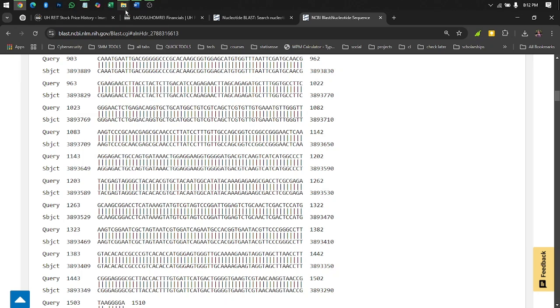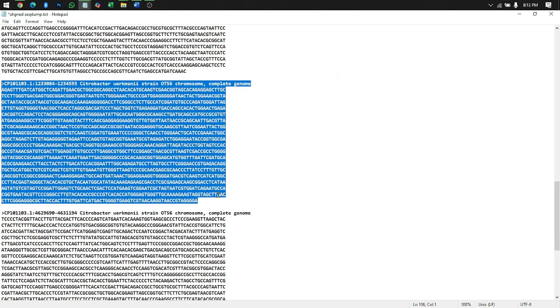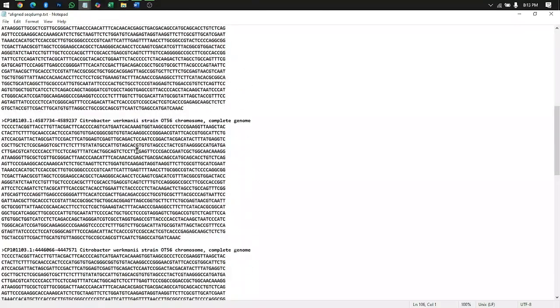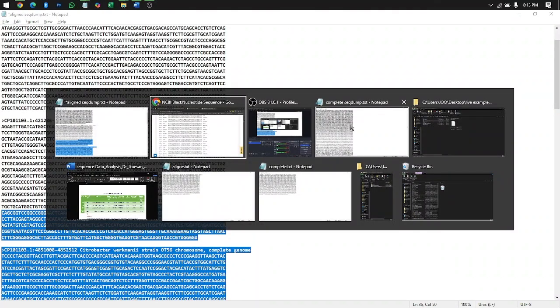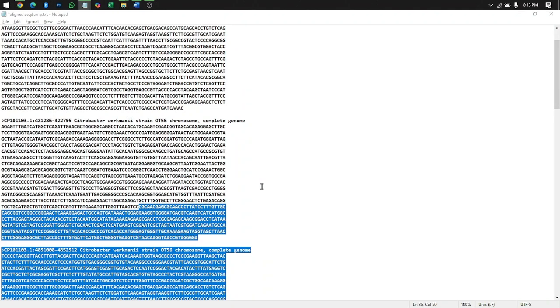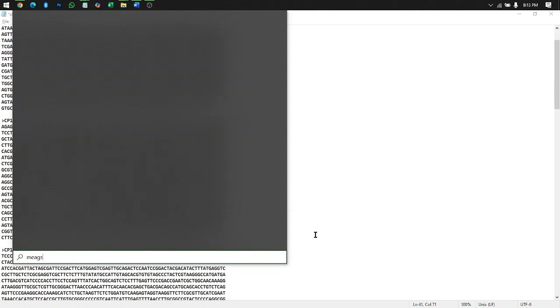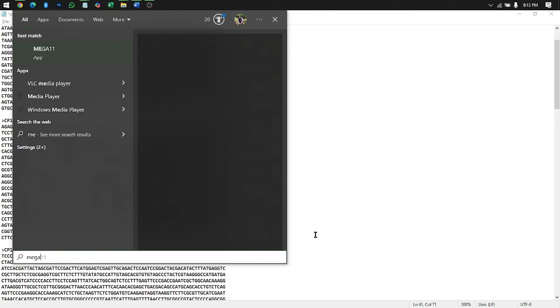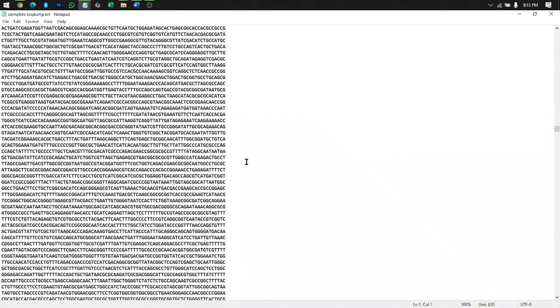So if you use an aligned file like we downloaded earlier, you don't know the exact part, so there's a tendency you might delete it in the process of saying, okay, I want to reduce it. But the complete sequence has everything. Once you bring that into MEGA, MEGA will do the alignments itself. That's why I prefer using the complete sequence.